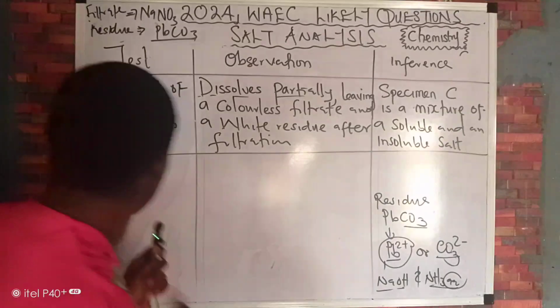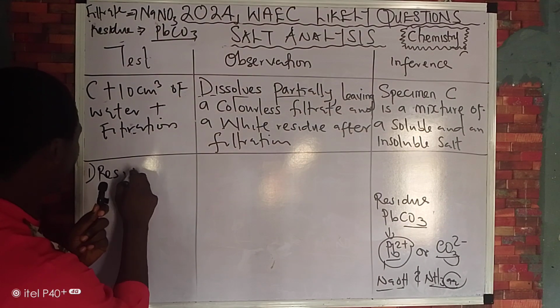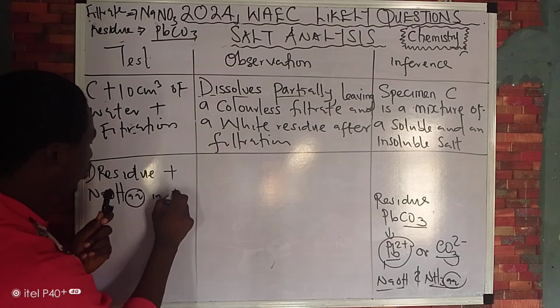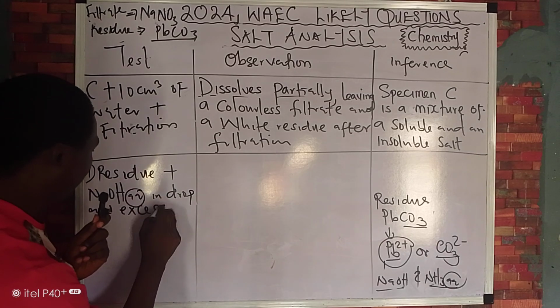Okay, now so what do we do? We simply do this. Watch this. Residue plus sodium hydroxide in drops and in excess. Take note of that.